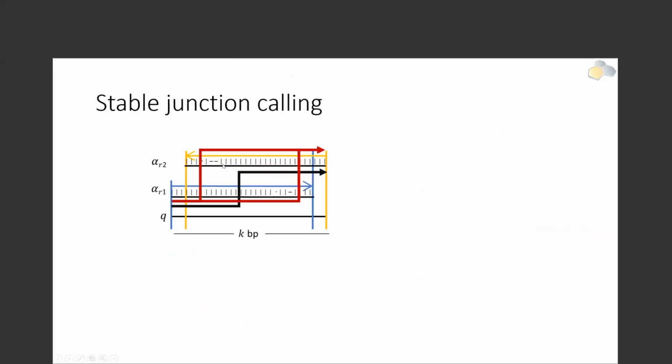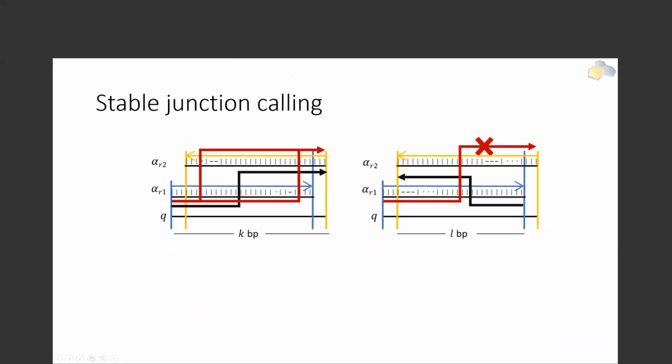This is an easy call. We just look into the overlapping region and we say that if we start here, then we include some mutations there, or if we go all the way to the end of the blue side alignment, then we include some mutations on that end. So that's not the way to optimize the score. So that was the goal: how to create the right junction, or detect the right junction, so it optimizes the score of the combined two split reads, the score of the alignment, that is.